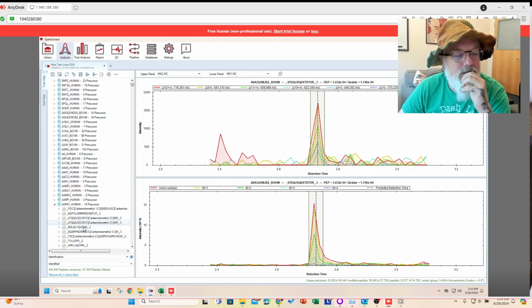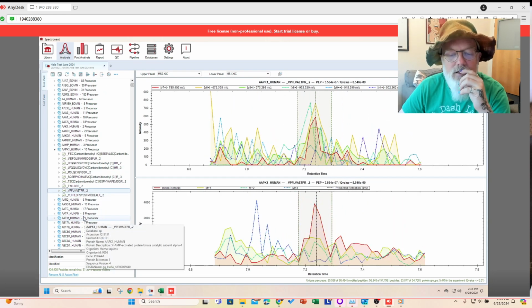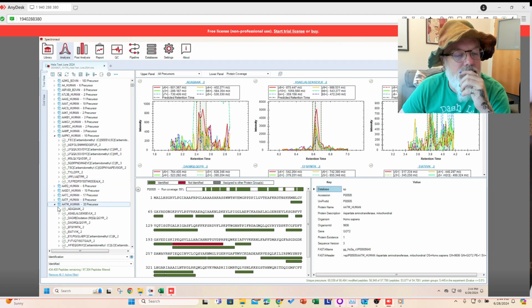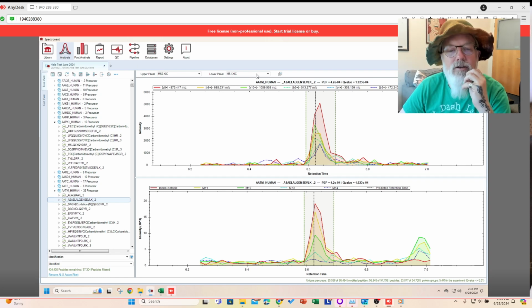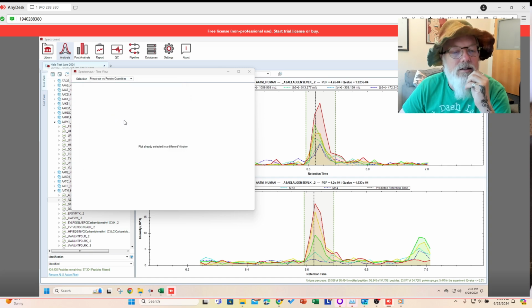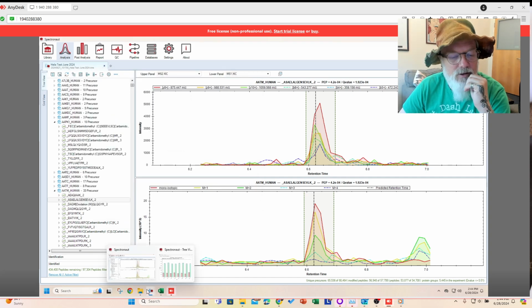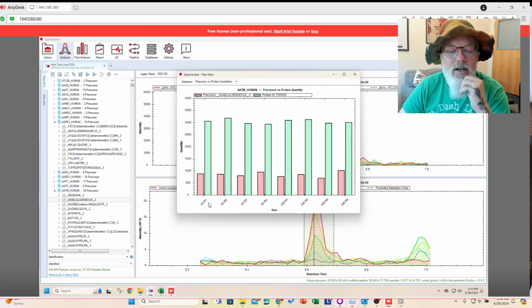Precursors, let's look at, that doesn't look too good. Let's pick something. This one again, and cross runs. It's already displayed. All right, so you can have multiple ones of these open. Okay, that looks better, right? So these should be 50, these should be 200.